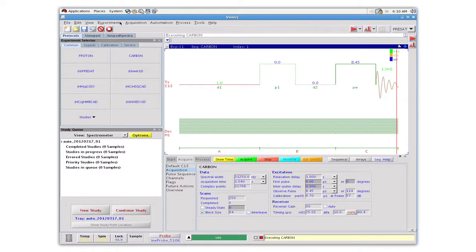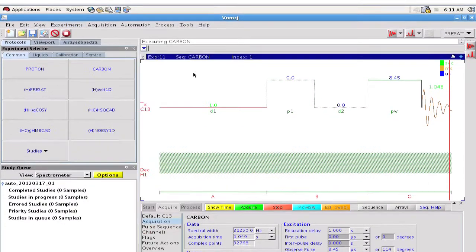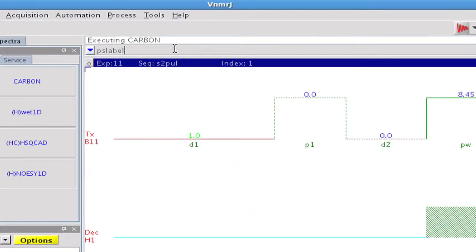A vinyl decaborane sample has been placed into the magnet, it is locked and shimmed, and the probe is tuned to the respective B11 and proton frequencies. First, we go to the experiment menu and request B11 detection. We do not yet have a B11 parameter set, therefore, the default C13 parameters are recalled and the transmitter nucleus gets converted to B11, defining the proper spectrometer frequency. We start from here and build a parameter set for B11, either based on experience or on literature data.